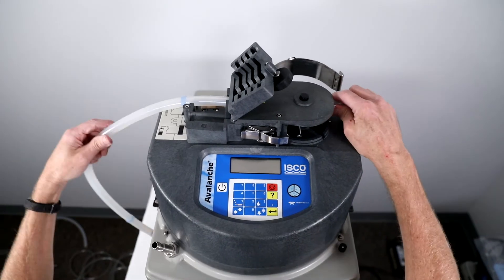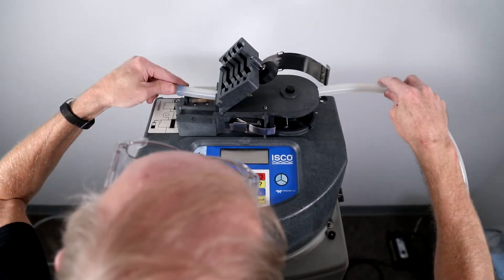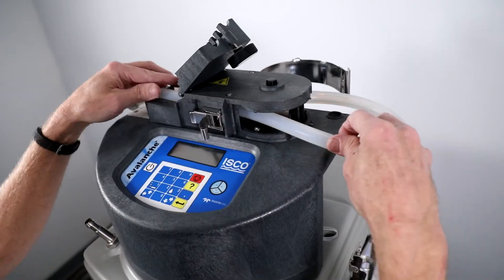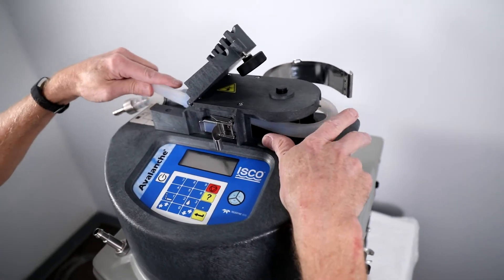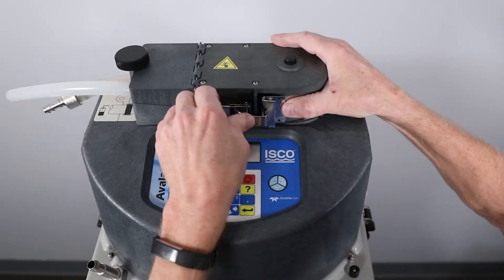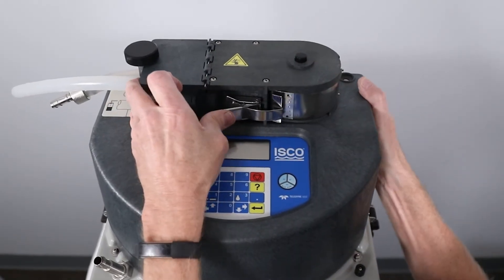Insert the new pump tubing into the sampler head, making sure that the blue band closest to the end of the new pump tube fits into the groove for connection to the suction line. Close the liquid detector cover. Hand tighten the thumb screw and re-secure the pump band latch.